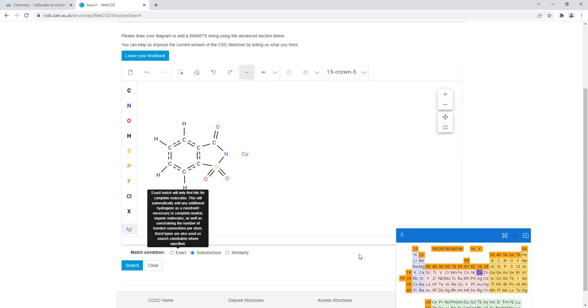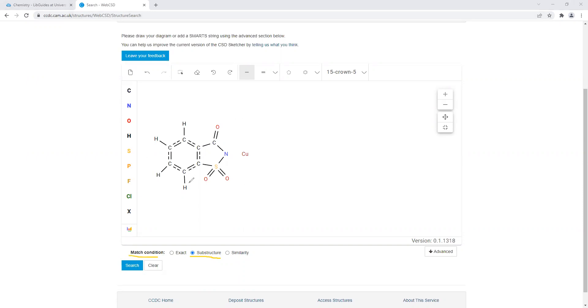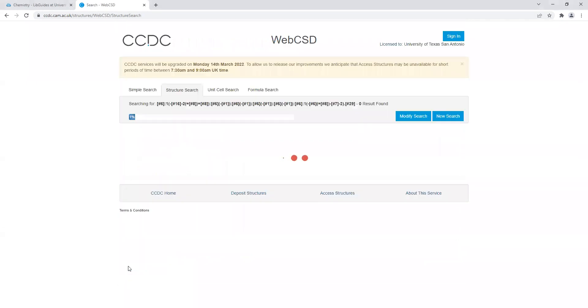Under match condition shown here, make sure you select substructure. It's going to look for all the different structures that have this component in it. Now we click search. It's going to search the database for all these types of structures.